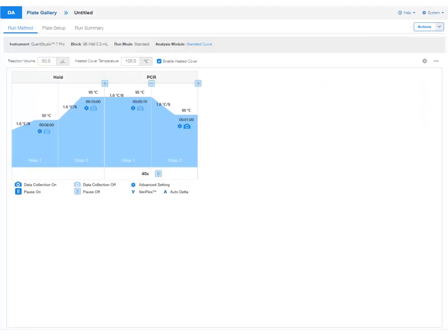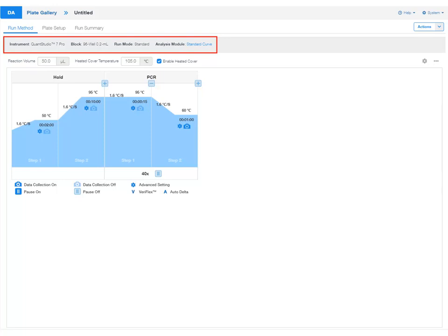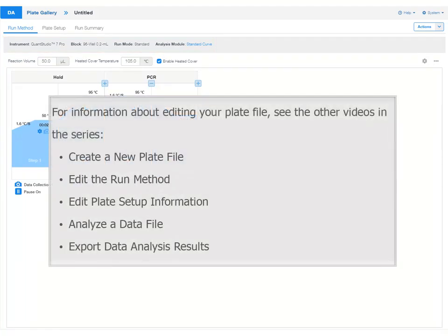The software creates a new plate file with the same run properties as the system template that you selected. For information about editing your plate file, see the other videos in the series.